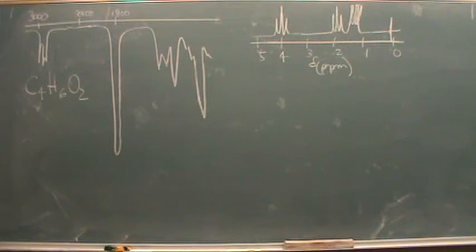Alright, we've got an NMR IR combo. Again, I've tried to replicate the NMR and IR as best I can from my originals. But I'll describe it, and of course as you do your own examples, you'll get familiar with what these kinds of diagrams look like when you actually see real things. We've got C4H6O2 here.